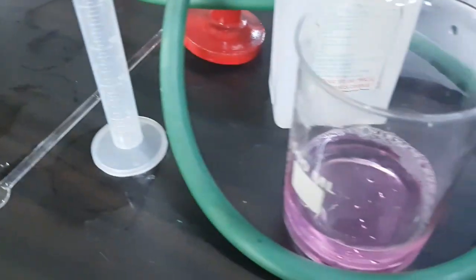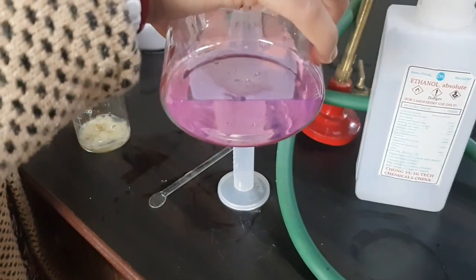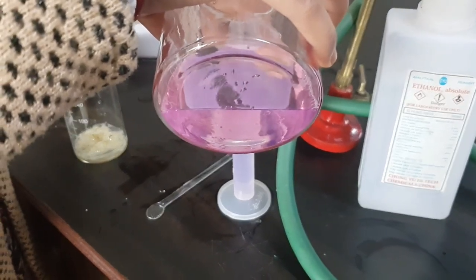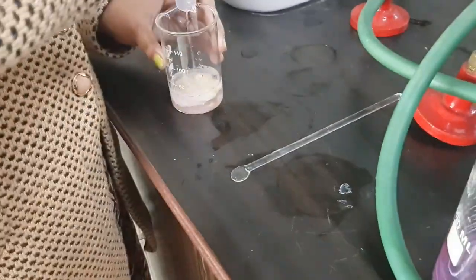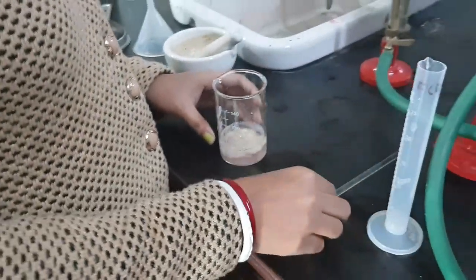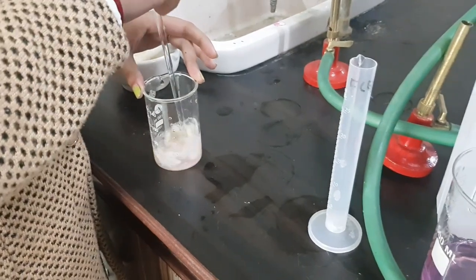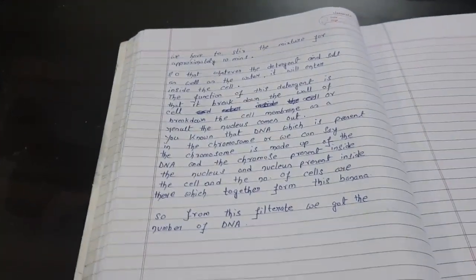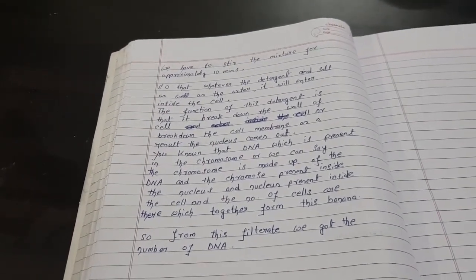Now we will add this mixture — that is the mixture of detergent, any type of detergent — along with salt, to the smashed banana. Next we have to stir it for 10 to 15 minutes. In between, I will explain things. We have to stir the mixture for approximately 10 to 15 minutes.